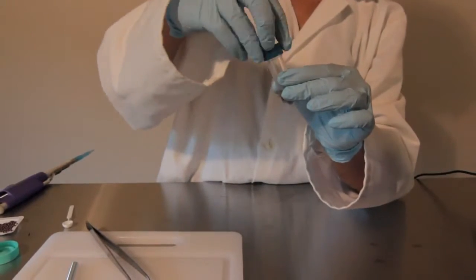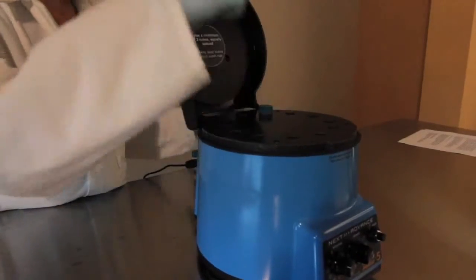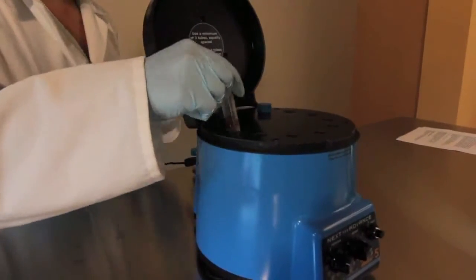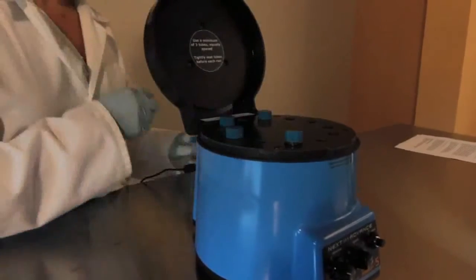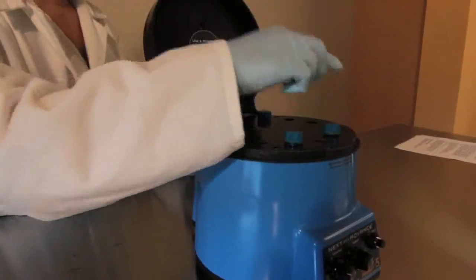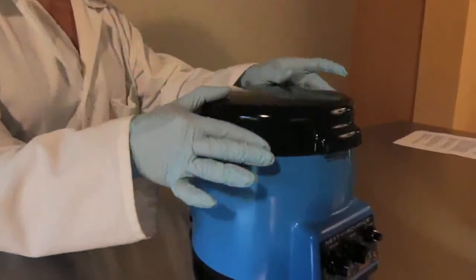This is very important. Make sure that your caps are closed very tightly before homogenization. Place them evenly spaced inside of the Bullet Blender. I have six samples loaded. I'm going to set the speed to 8 and the time to 3 minutes. Close the lid and press start.